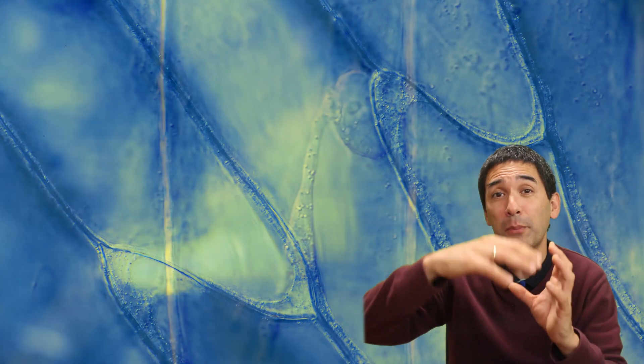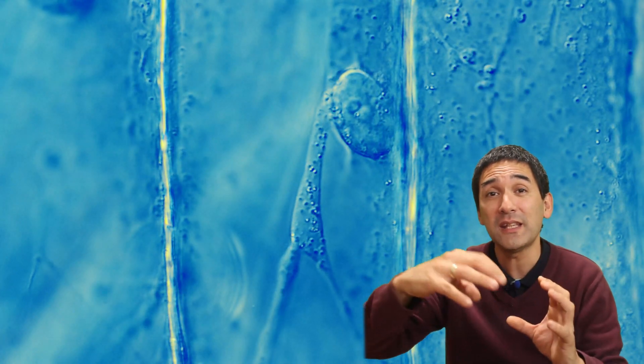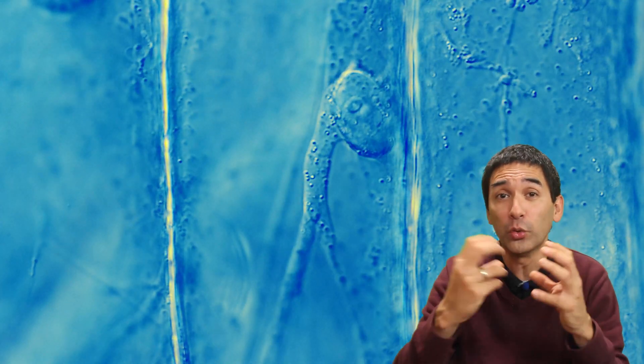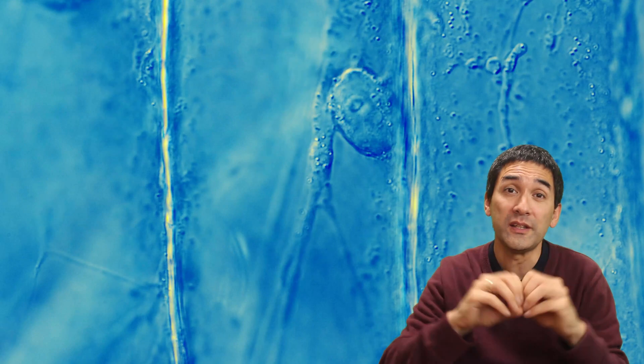This is because the central part of the cell contains a large vacuole. The vacuole is a structure inside a plant cell which is for storage. For example, water and minerals are stored inside the vacuole. Other things that you can see are the nucleus—the round oval structures. The nucleus contains the DNA of the cell.